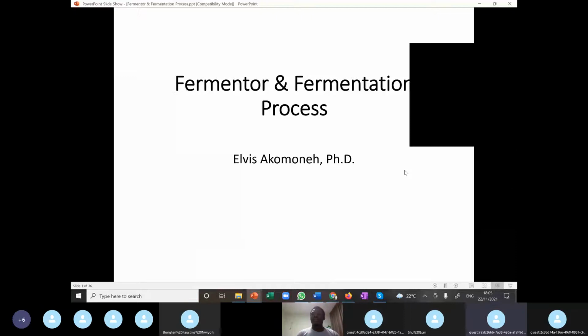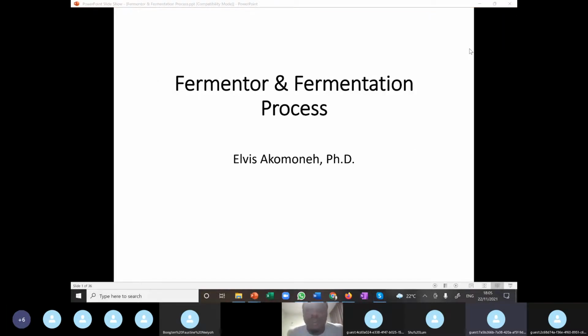Good evening once more, and as I indicated, today's lecture is going to focus on a fermenter and the fermentation process. Here we're going to describe the fermenter, which is the vessel with a controlled environment used in fermentation. And we'll look at the fermentation process, basically having a broader picture on the different stages that are employed in the fermentation industry, from upstream processing through the fermentation itself and downstream processing.